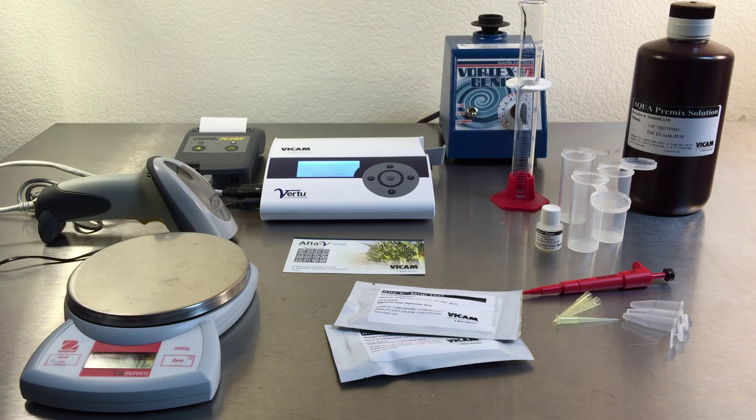Disposable supplies include the Afla-V Aqua strips, Afla-V Aqua premixed extraction solution, filters, extraction tubes, and pipette tips.